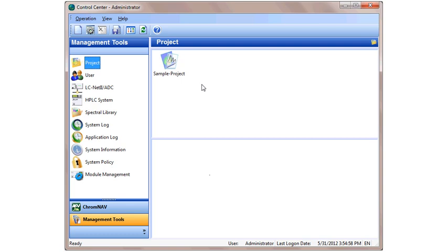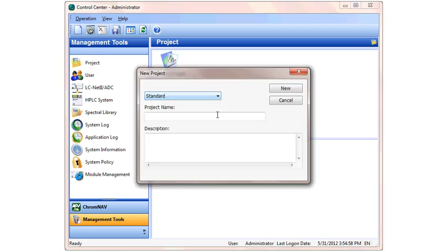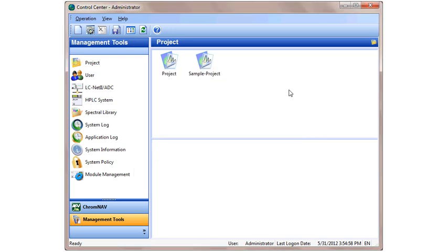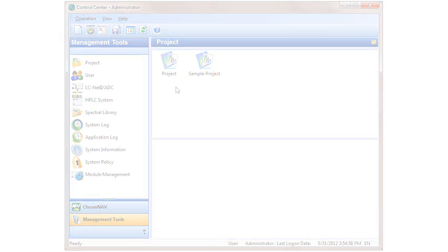To create a new project, simply right click, select New, and type in your project name. After doing so, click New, and you'll see your new project has been created. Thank you.